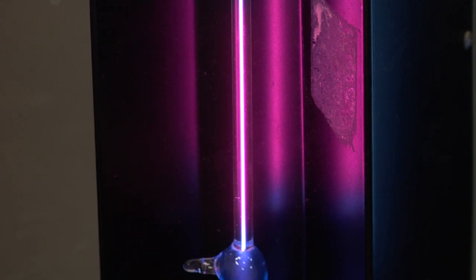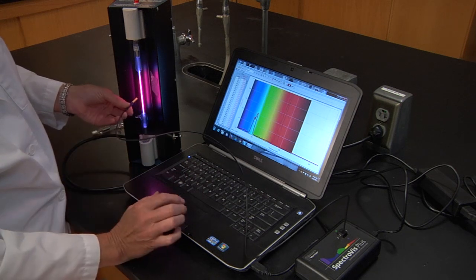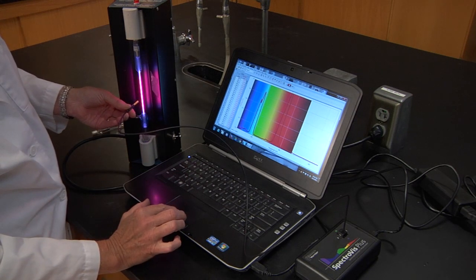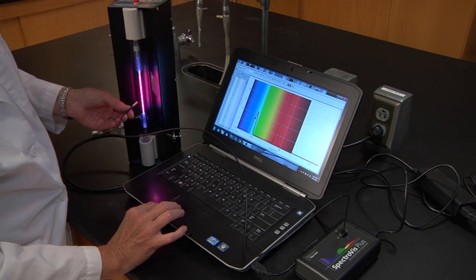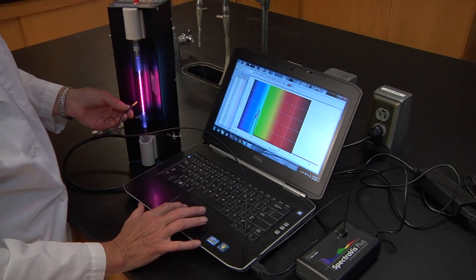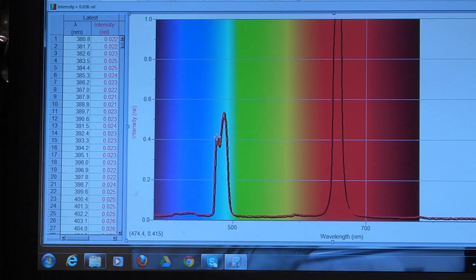So we're going to put our fiber optic cable next to the light and you can see what wavelengths are being emitted. Here you can see three very distinct peaks and that makes up the fingerprint for hydrogen.